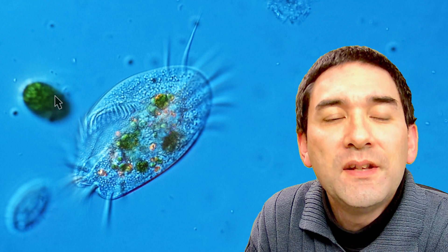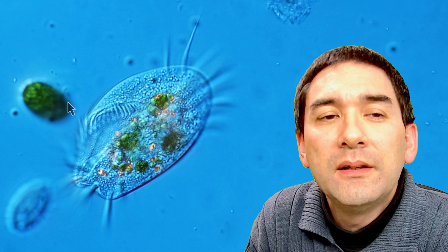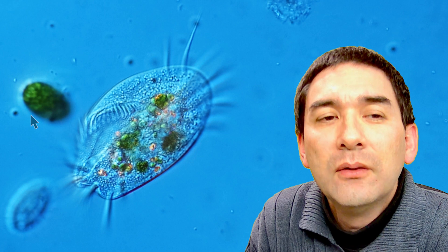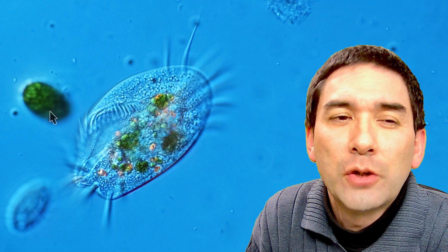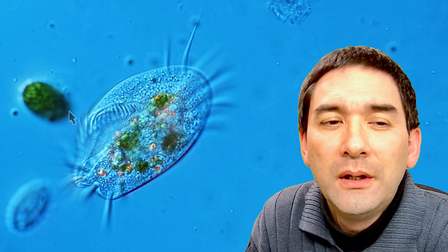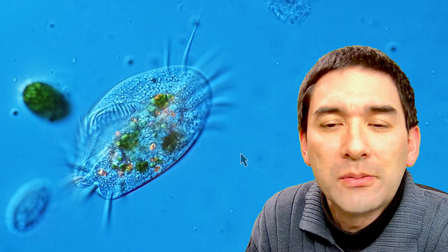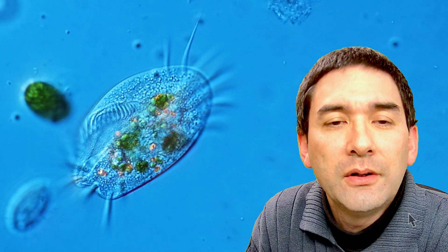Unfortunately blurry. If it's green like that it could be that this is a protist which actually has green endosymbiotic algae. I'm not so sure about this. It's kind of blurry but it's quite well possible. Okay so let's move on a little bit over here.